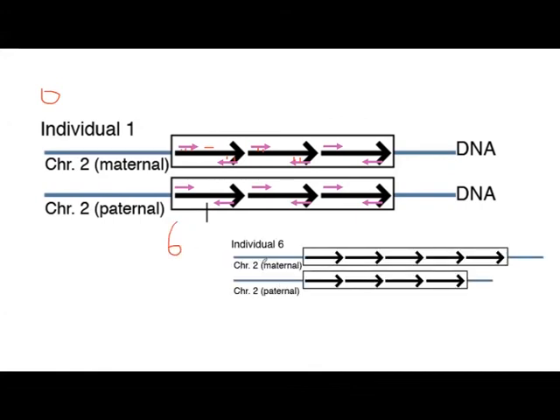Now, if I want to do the same for another individual, how many repeats do we have here? 1, 2, 3, 4, 5, 6, 7, 8, 9, 10. And you're going to design the same primer left and right for all of this. Because this has 10, even if you start with the same amount, if I use 10 nanogram DNA in all of this and 10 nanogram DNA here, the same starting material, because this has more repeats, you're going to get more quantity than this one. Because you have 10, the primer will bind to 10; here the primer will bind to 6 regions. So that's why the CT value here will be lower than this one.